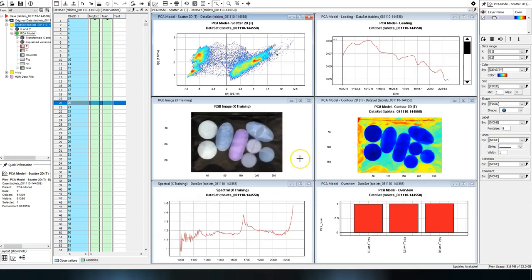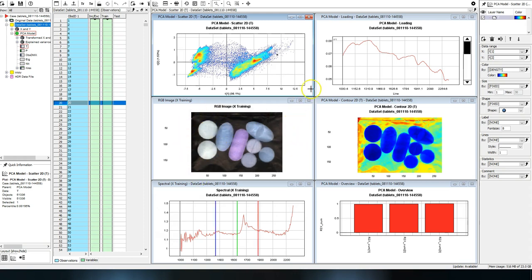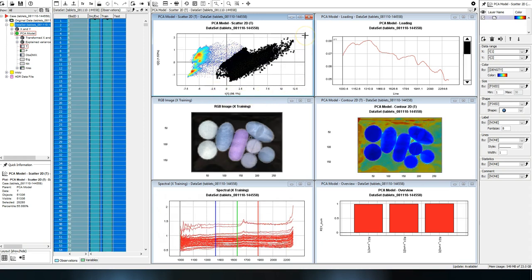The plots and tables in EVINS are interactive and linked, which is useful when doing exploratory analysis. If you hold down the left mouse button and make a selection in a plot, it will highlight the corresponding data in other plots as well as in the table.